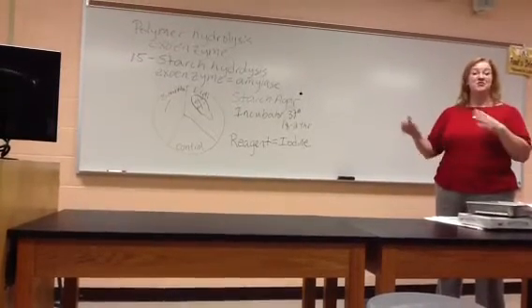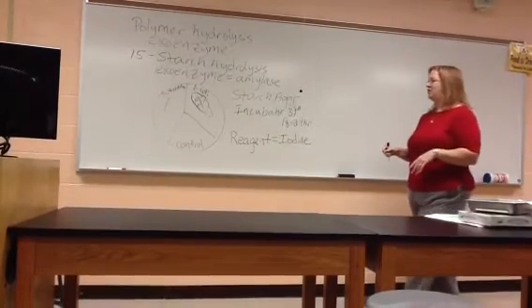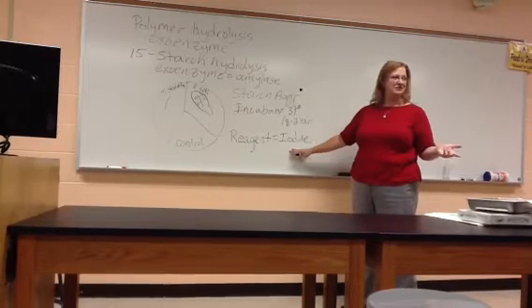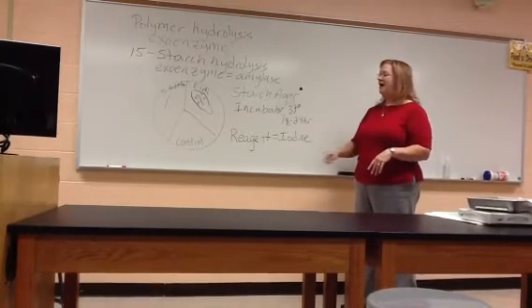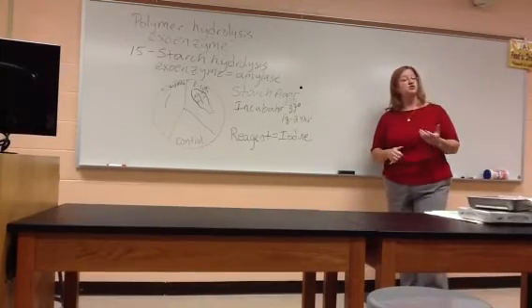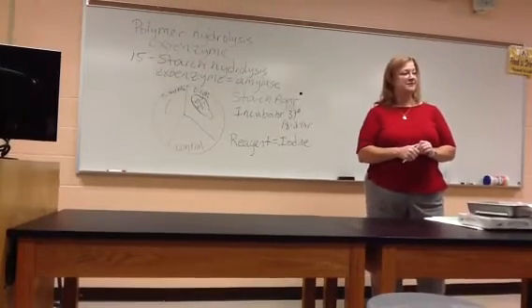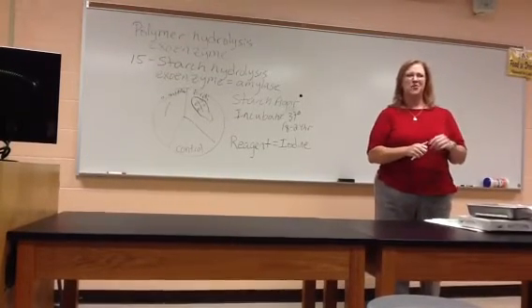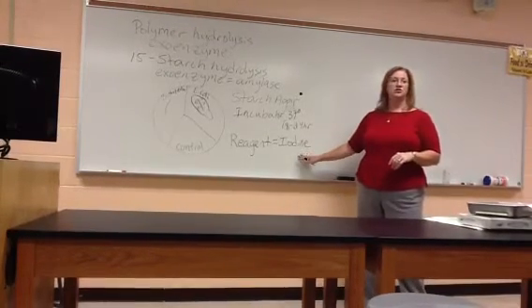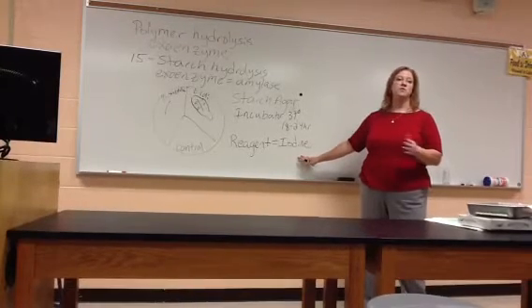So far we've plated the bacteria, and we put them in the incubator to grow. After 18 to 24 hours, we're going to add the reagent iodine. We'll put them in the fridge for you so you can see it on Monday. Iodine, like Jamel said, when you mix iodine with starch, it turns blue-black. What color is iodine normally? It's a brownish yellow, kind of amber color. But when you mix it with starch, it turns a really dark blue-black. And in our labs, it's always been more toward black than blue.